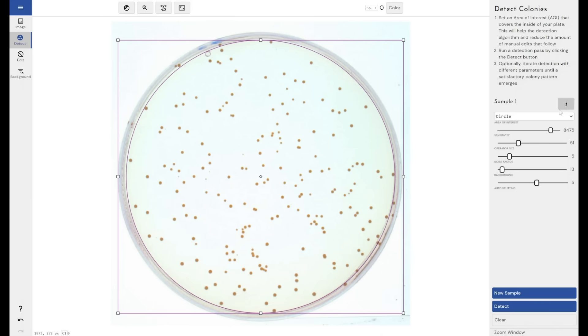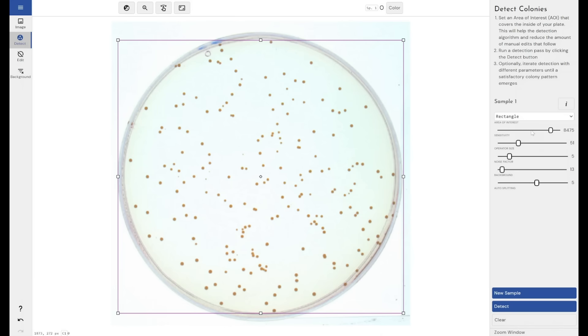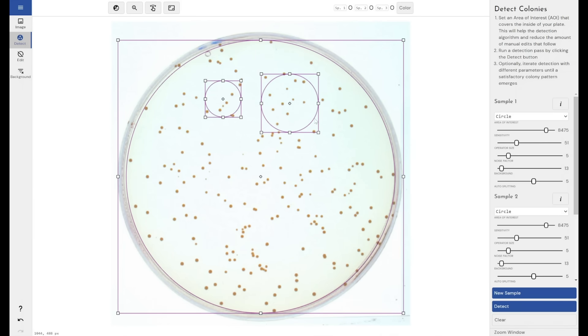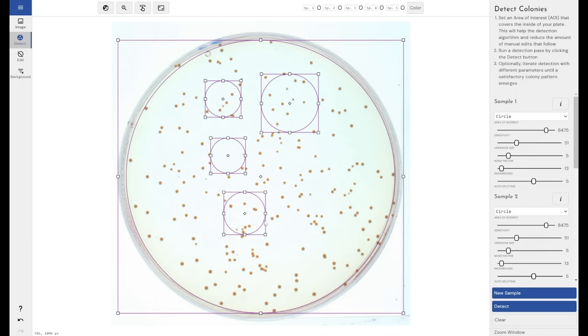You can change this to be a rectangle. If you're using slides or square well plates or something that is rectangular in shape, you can change that to a rectangle. I'll change that back to a circle now. You're not limited to just one circle. You can draw as many as you want, and they will all be treated as individual areas for detection and counting.